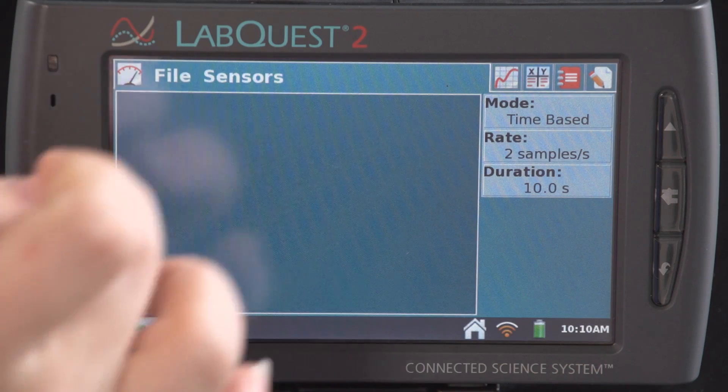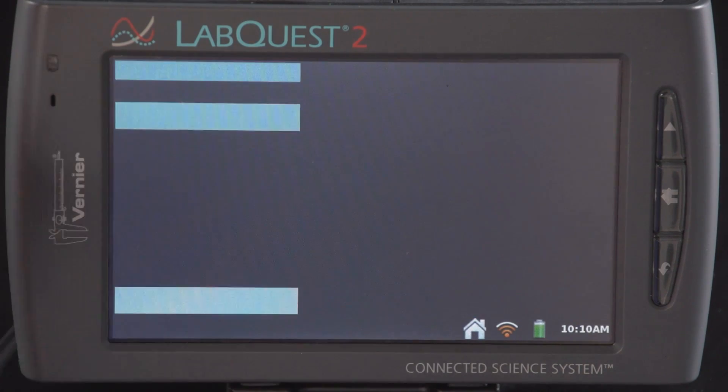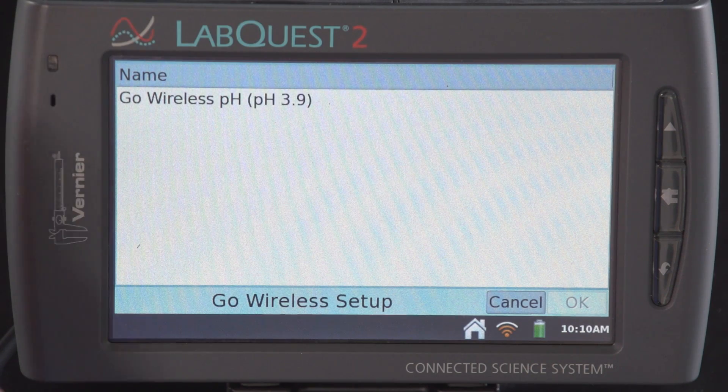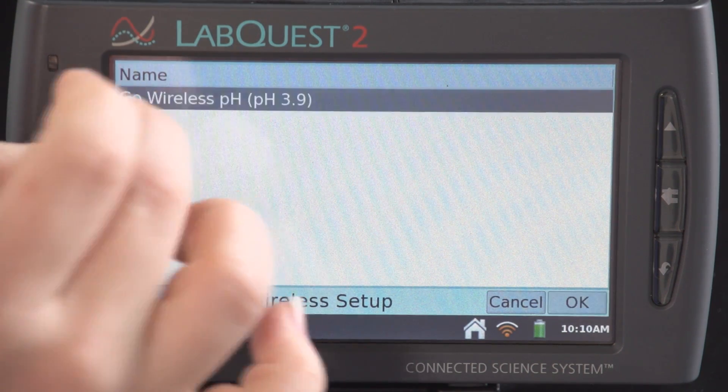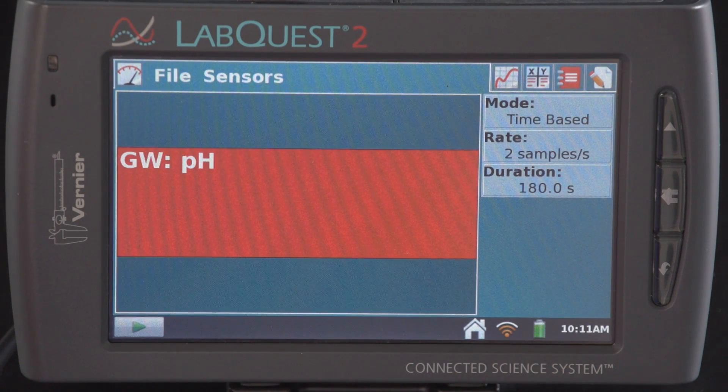Now that everything's on, I can connect the Go Wireless PH to my LabQuest 2 via Bluetooth. From the sensors menu on the LabQuest 2, I'll select Go Wireless Setup. When I first connect to the Go Wireless PH, it'll read 'Go Wireless PH.' I'll select that and say OK. Now I should see the PH reading.